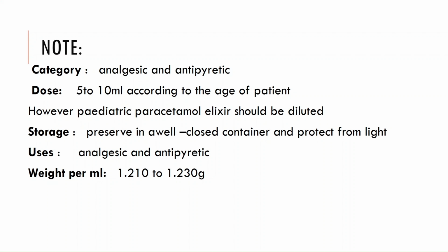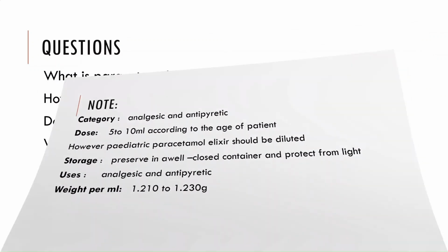And then weight per mil, we always have 1.210 to 1.230 grams per mil, each mil in a preparation.